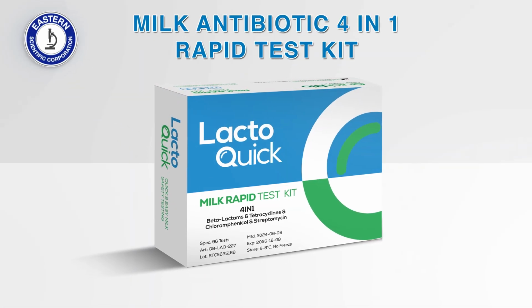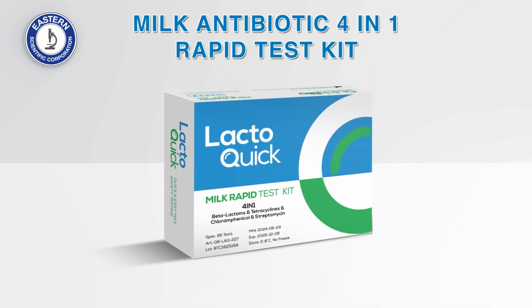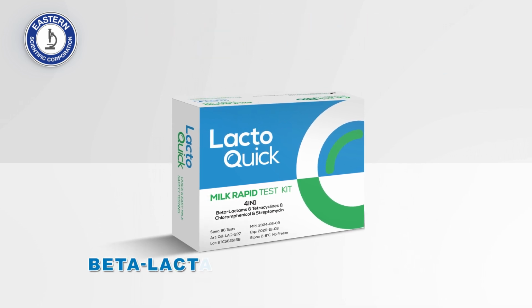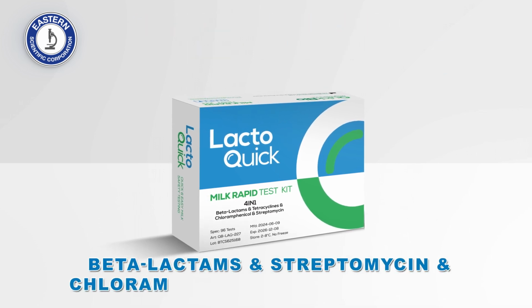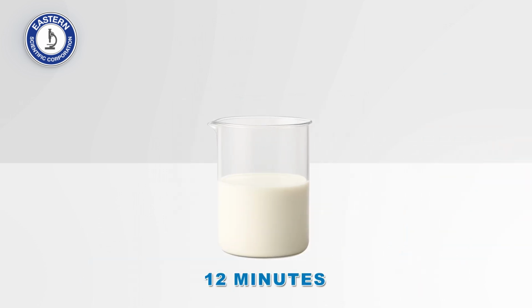Milk Antibiotic 4-in-1 Rapid Test Kit. Milk Antibiotic Residues Rapid Test. This rapid test is used for detection of beta-lactams, streptomycin, chloramphenicol and tetracyclines in milk. It takes about 12 minutes.